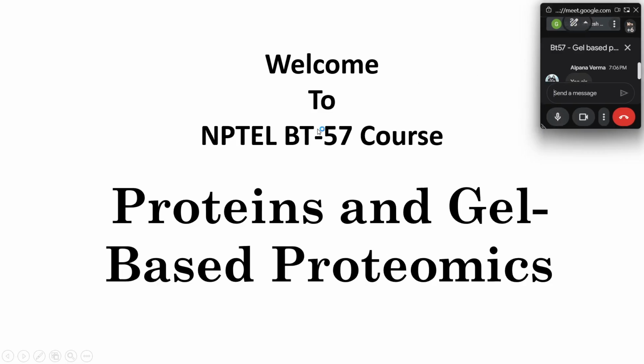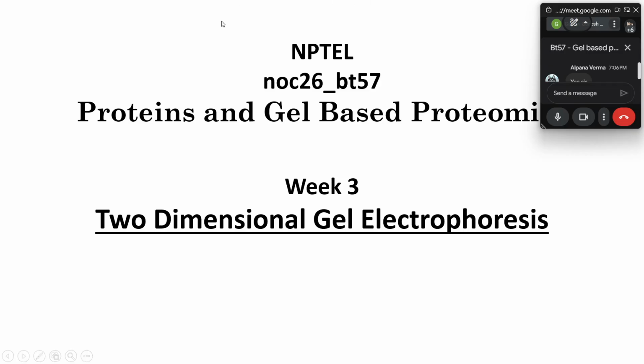Okay. Yeah. So welcome to week three of NPTEL course, which is proteins and gel-based proteomics. This specific course has a code of BT57. So today's lecture is about week three lecture. So just to tell the introduction, in NPTEL every week there are 5 lectures which are generally uploaded. You all go through that, and if you have any doubts, we as TA try and solve those doubts for you all. In week three, Sir majorly talked about two-dimensional gel electrophoresis technique, how exactly that is performed, how samples are prepared, how it is used, applications, etc.